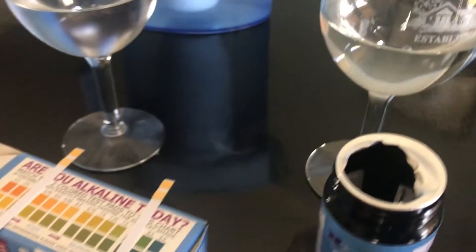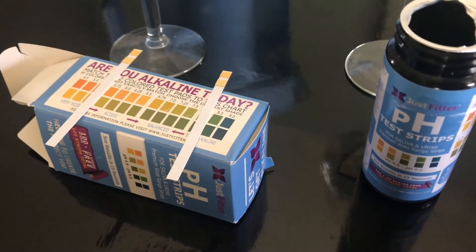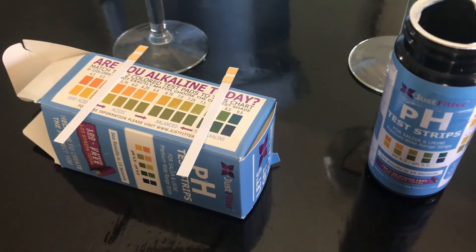We bought this pH paper and now we would like to measure it.